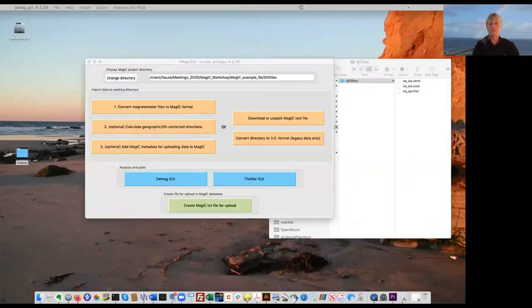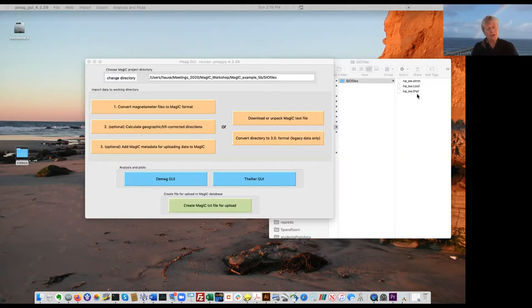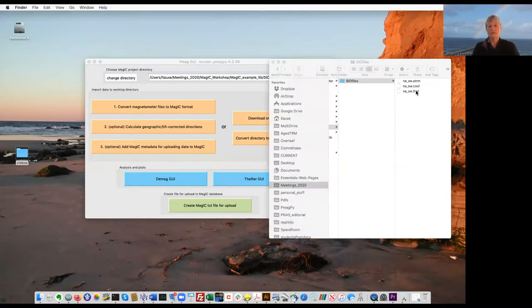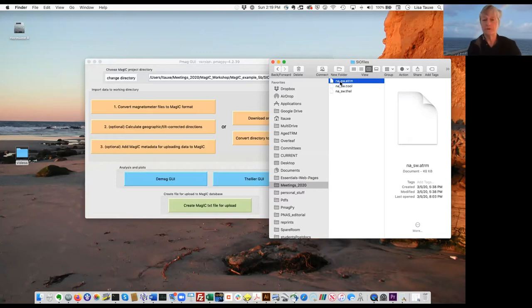Now I'm assuming you have downloaded the three files we're going to practice uploading. I have them in a directory called SIO files. The three files are NA_SW.ATRM, NA_SW.COOL, and NA_SW.THEL. The THEL file is the IZZI experiment, the COOL file is the cooling rate experiment, and the ATRM file contains anisotropy of TRM data.